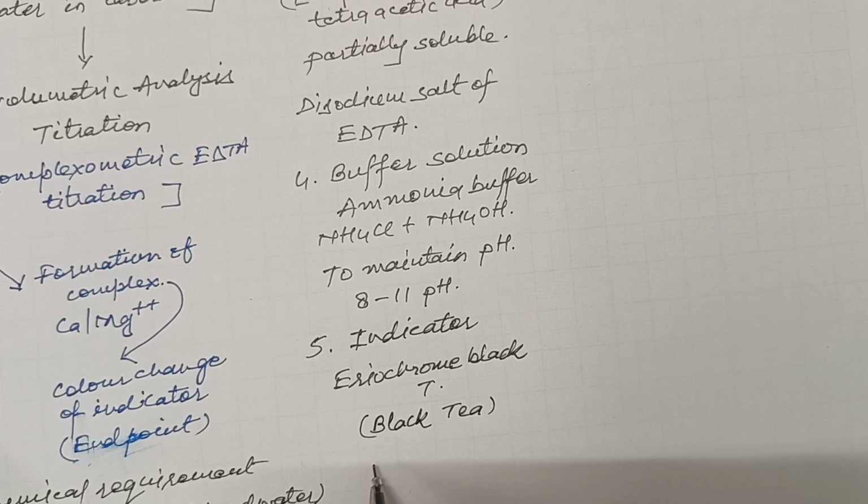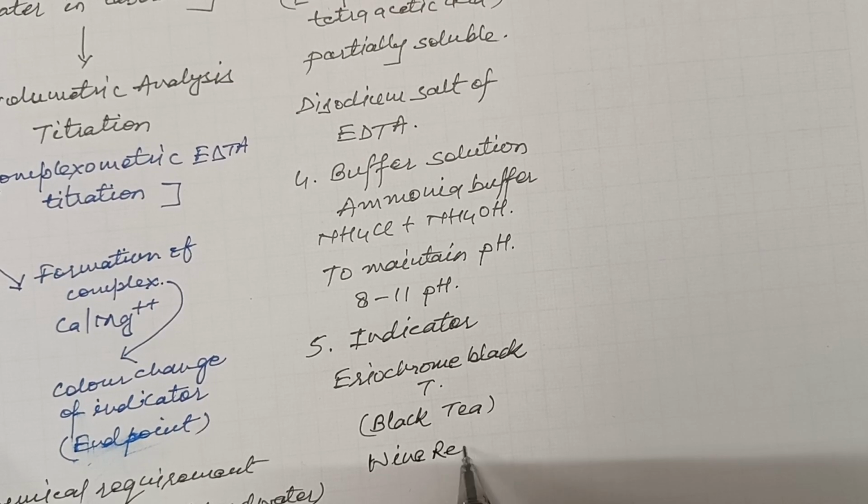This indicator shows a specific color range, which is wine red to sky blue.